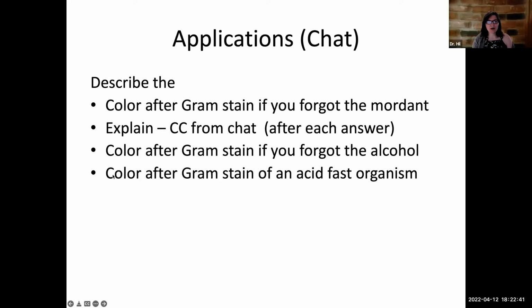Okay, so color after gram stain of an acid-fast organism. What do you think, guys? Put your answer into the chat. You've got an acid-fast organism and you do a gram stain on it. What color will you see? Don't Google this. Think about it logically.